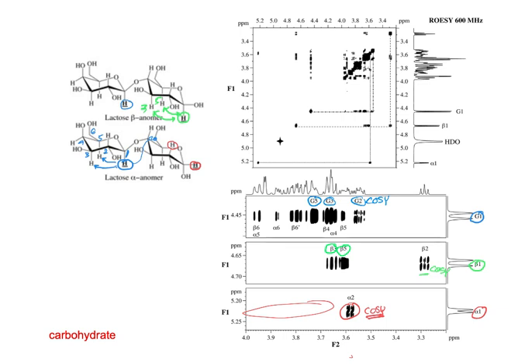Or I was looking for the alpha and beta 4, and here they're right here, but they're also buried underneath G3, so that's hard to see. But yeah, beta 6, alpha 5. I'm not quite sure. Those seem a little farther away than I might expect.